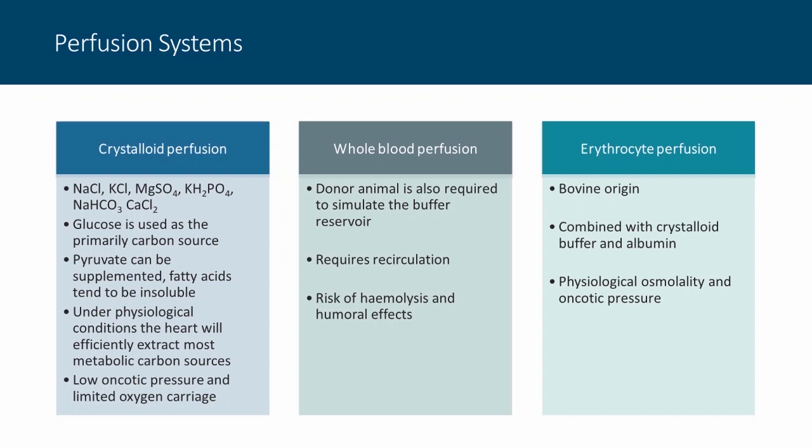So what are some of the systems we can use? Obviously, these are all perfusate systems. There's three main ones that we're going to talk about today: either crystalloid-based, whole blood perfusion, or an erythrocyte preparation.